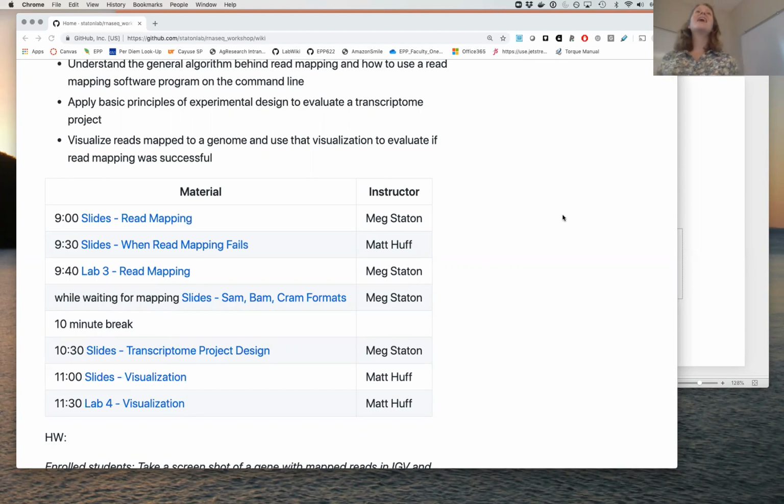Regular sequencing. So deep sequencing, I wouldn't say that I know if there's an actual officially accepted cutoff, but deep sequencing, I would consider getting a lot of coverage of all of the different parts, all of the different genes that are being expressed in that tissue. So in my mind, when you're working with a large eukaryote and the ENCODE consortium, actually this will be in a lecture today, they recommend about 20 million reads, which I would say right now is probably about normal coverage. 80 to 100 million reads is deep sequencing. Like you're really fully sampling rare transcripts.